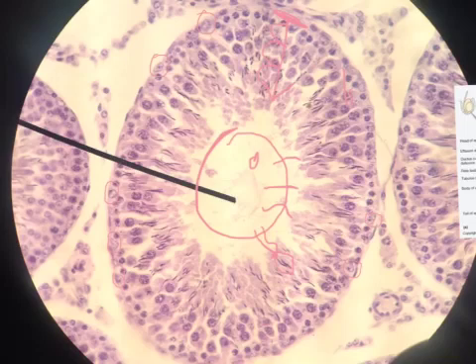And they actually have this very small nucleus. And so you're going to see those. So does that make sense to you? I'm just picking out each one. And so the rest of them are spermatogenic. These are sustentacular, also known as nurse cells, also known as Sertoli cells is the other name for them.